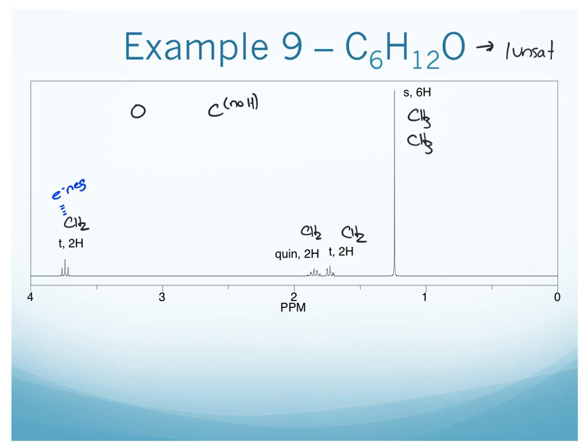Okay, first of all, I need the CH2 connected to something electronegative. My only option is this oxygen. Now an oxygen needs to make a second bond, but I don't have any other hydrogen signals indicating connection to something electronegative. So it's probably connected to this carbon that doesn't have any hydrogen, therefore you don't see its effect.